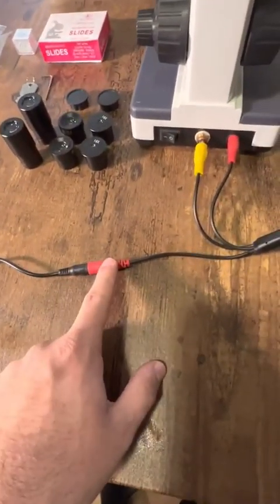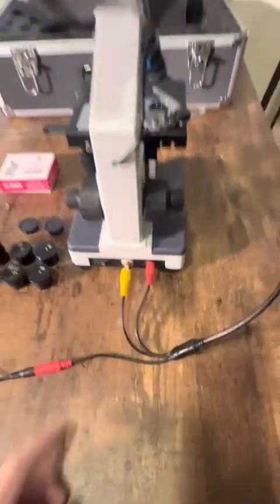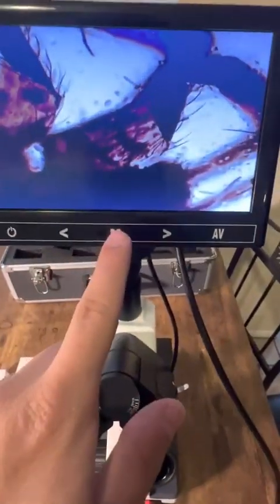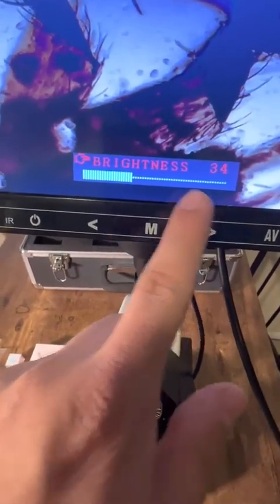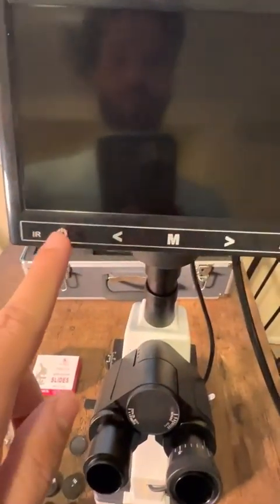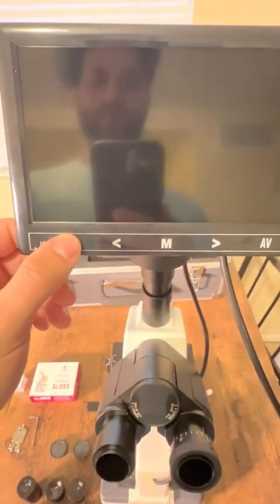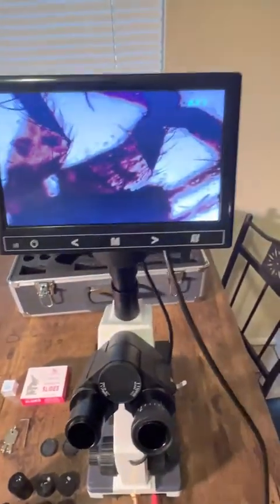You just do power to the red 12-volt, then 12-volt in, and then you have your AV out to the AV monitor. You just brighten it like this and then you can power it off or power it right back on. Bam, there you go — super easy.